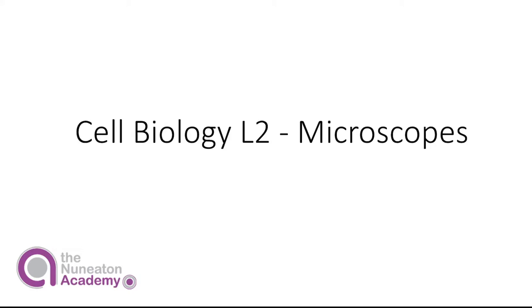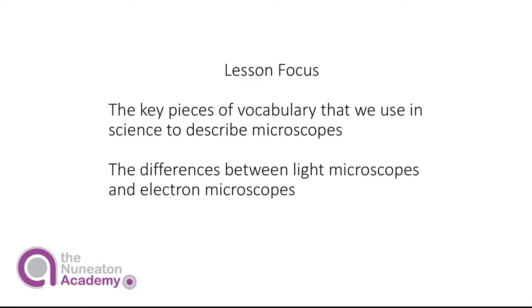And welcome to the second summary video for the GCSE topic of cell biology. In this lesson, we are going to be looking at microscopes. We want to explore the different types of microscopes and introduce new vocabulary which is focused around microscopes. Therefore, our key focuses for this lesson are the vocabulary itself, which we use to describe microscopes in science, as well as the differences between light microscopes and electron microscopes.